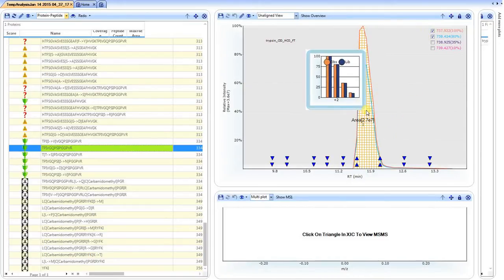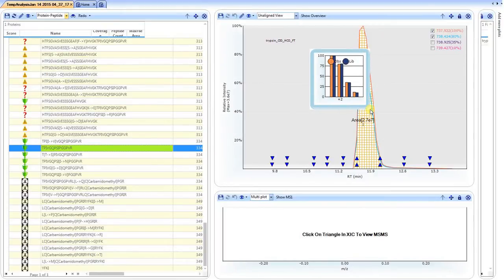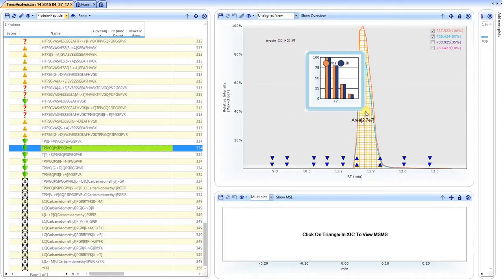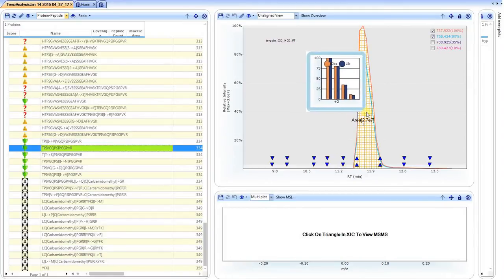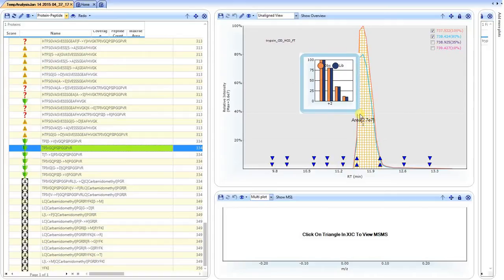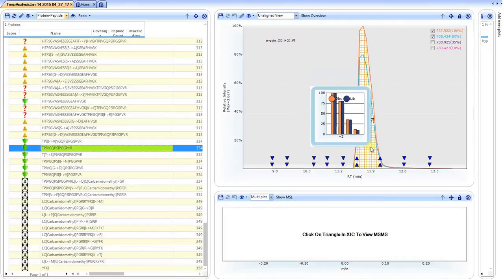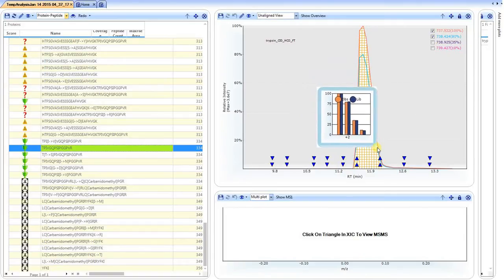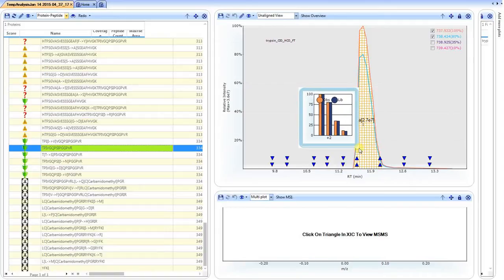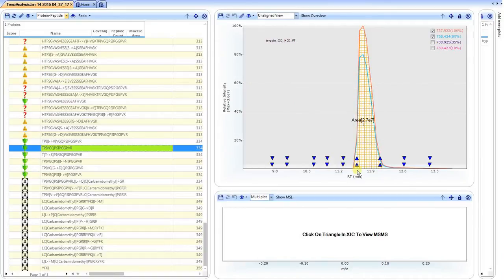We can evaluate the isotopic distribution for the precursor by simply hovering our cursor in the peak area. This represents a real-time isotopic analysis, so you can evaluate at the leading and the tailing edge. The blue triangles simply represent MS2 spectra that contain this particular precursor charge state.